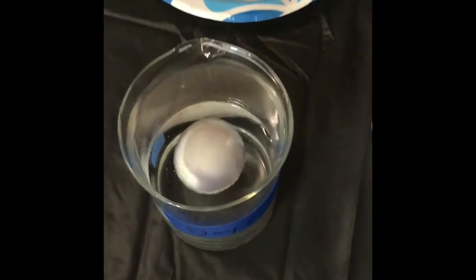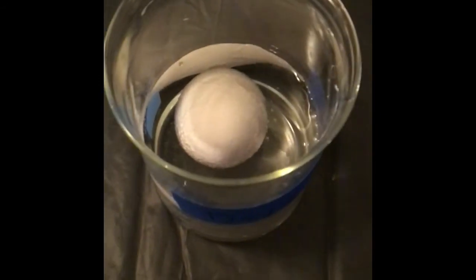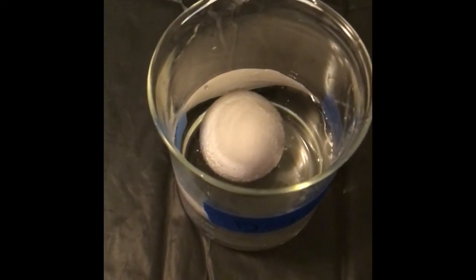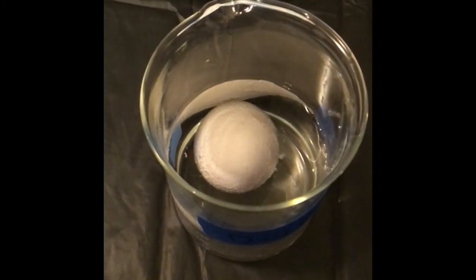I'm going to zoom in on the egg again so you can see what's happening. I'm going to leave it a few seconds on the egg. Again, the egg is in just regular white vinegar. This concludes day 1, part 1 of our experiment.